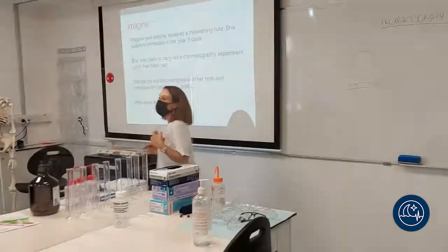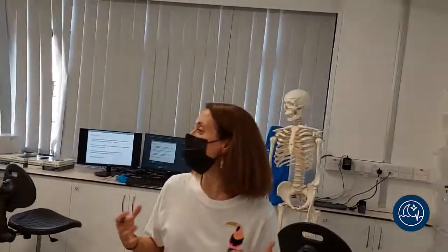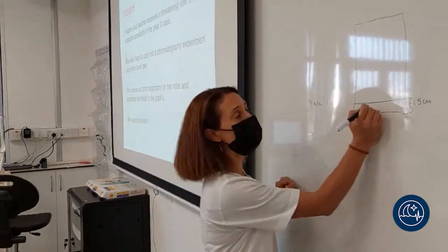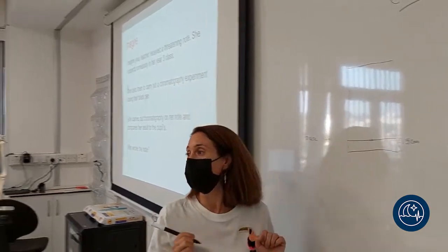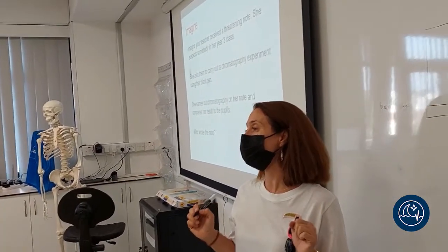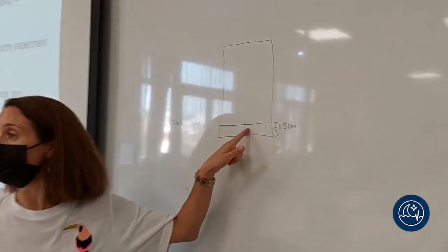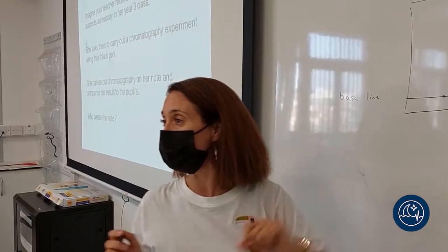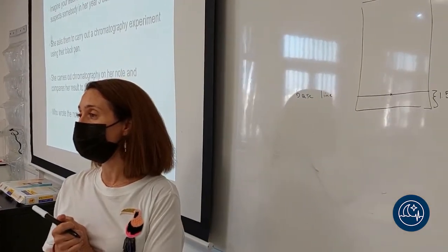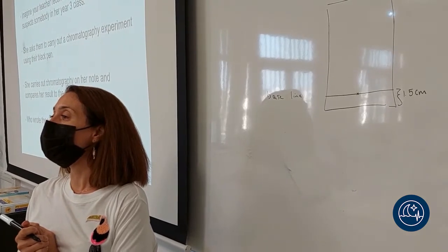Fine, that's good. Guys, because we're only investigating one colour, one pen, we're not investigating many pens, you can draw with your pencil a lovely little cross in the middle of your baseline. Little cross, just in the middle, with your pencil.